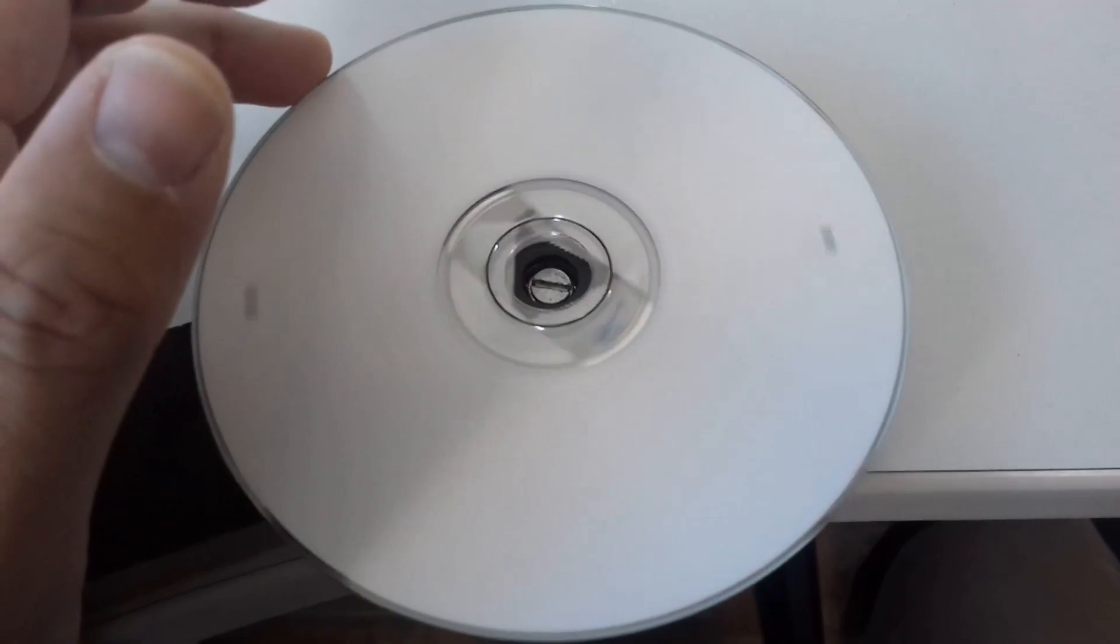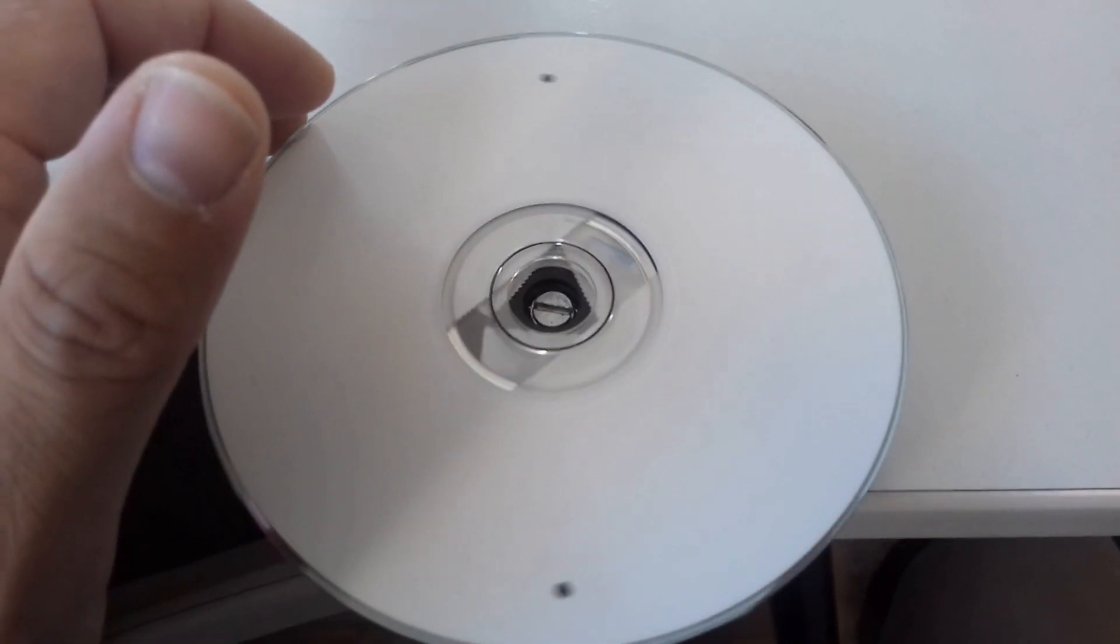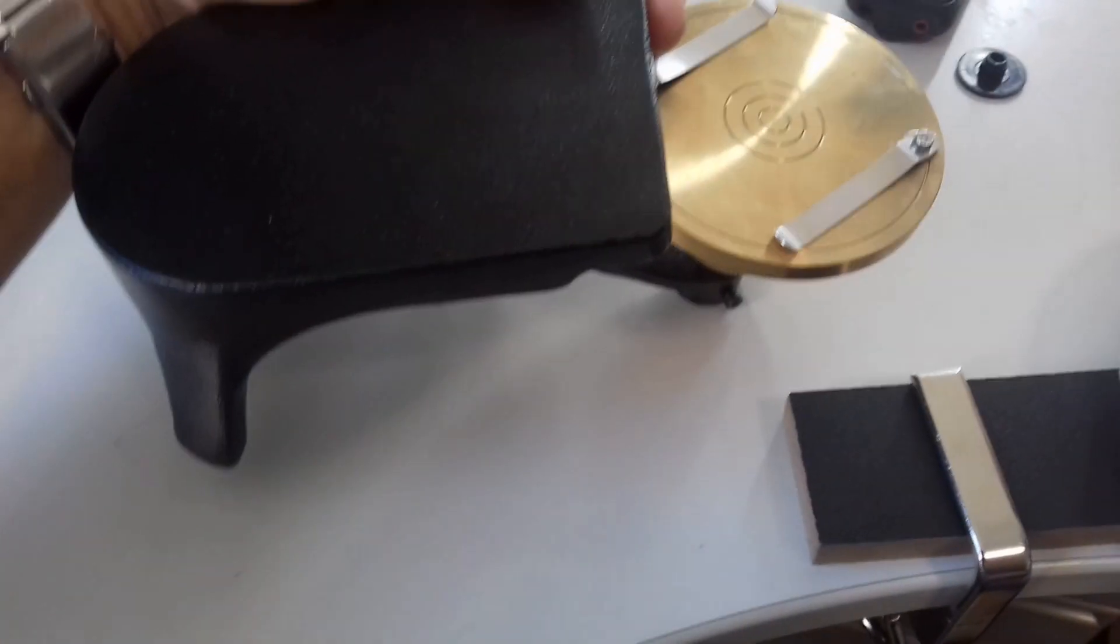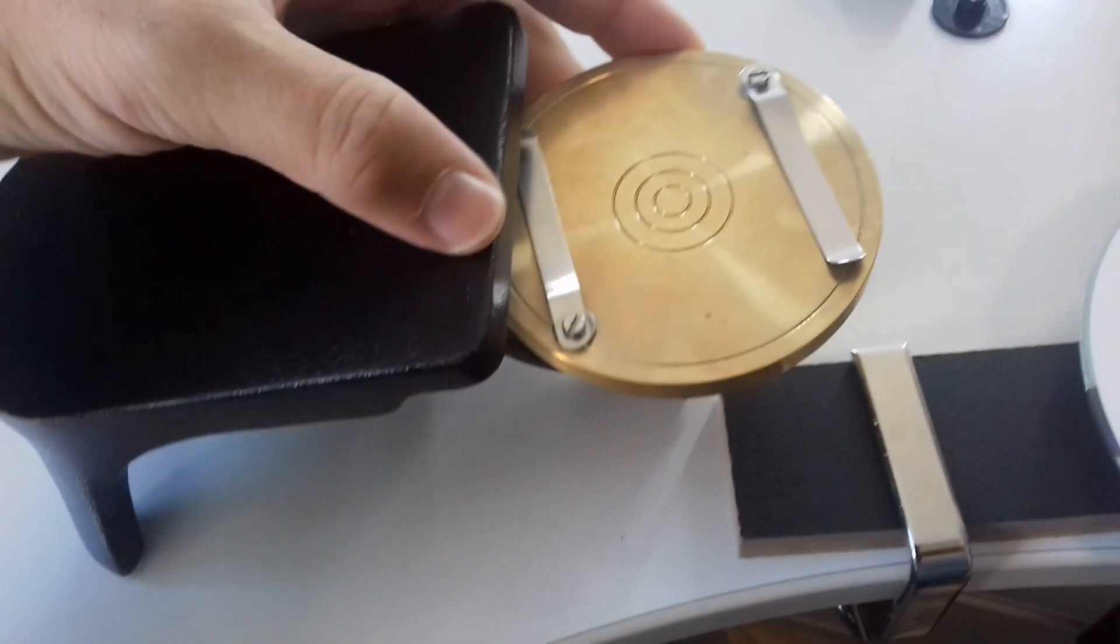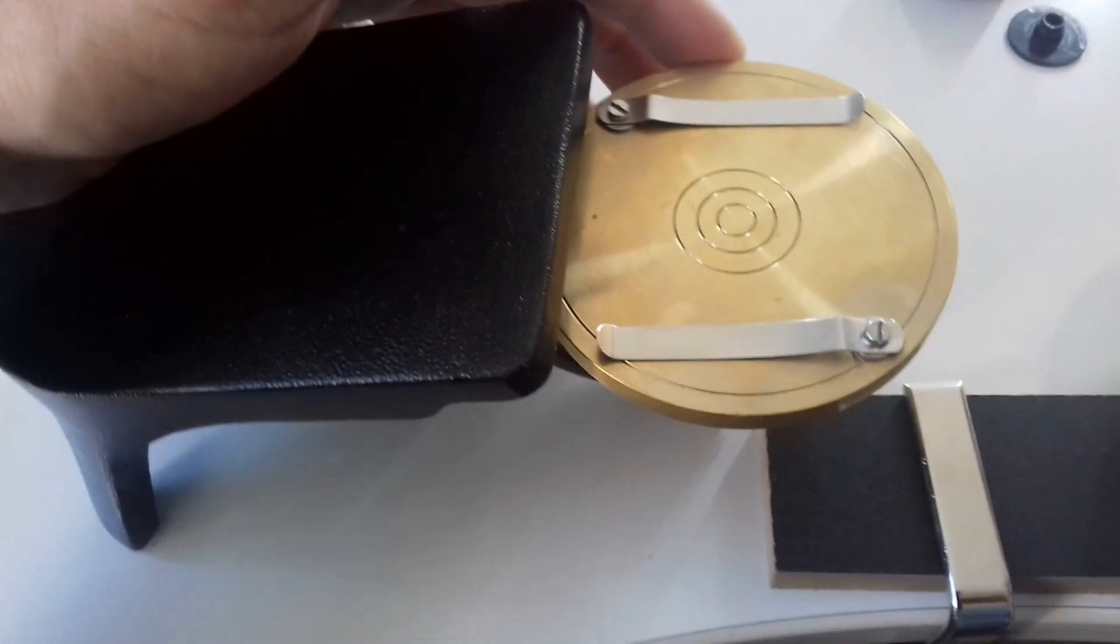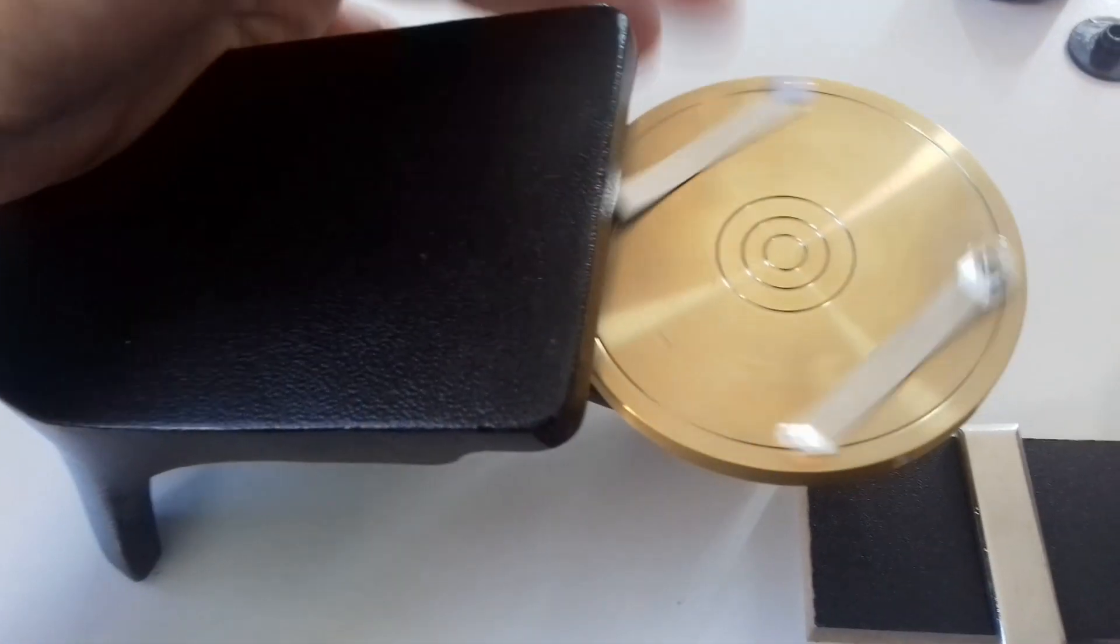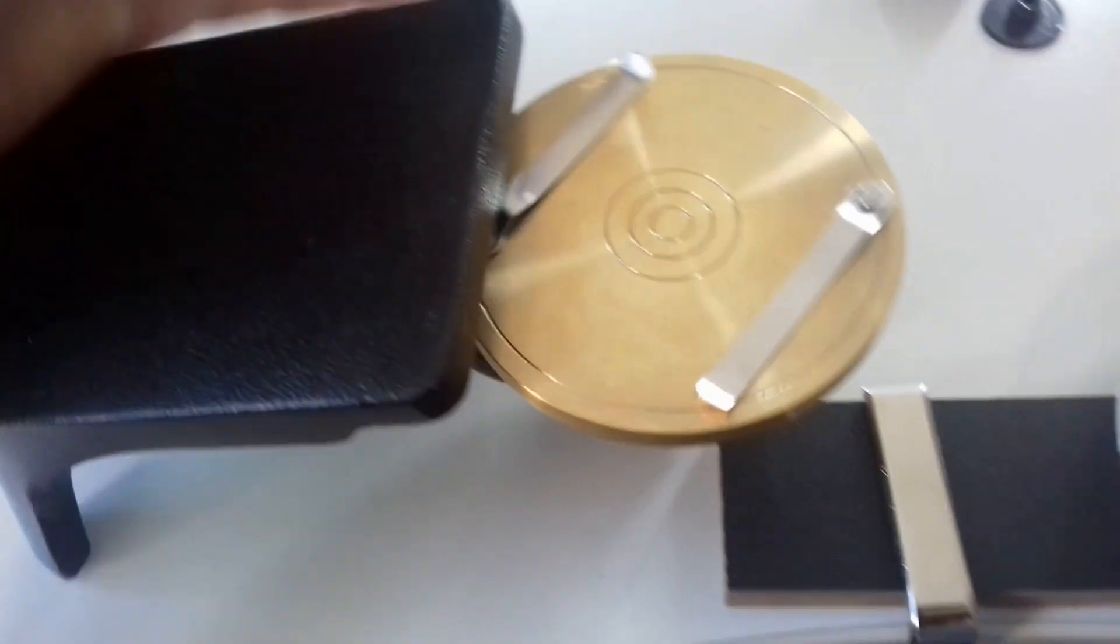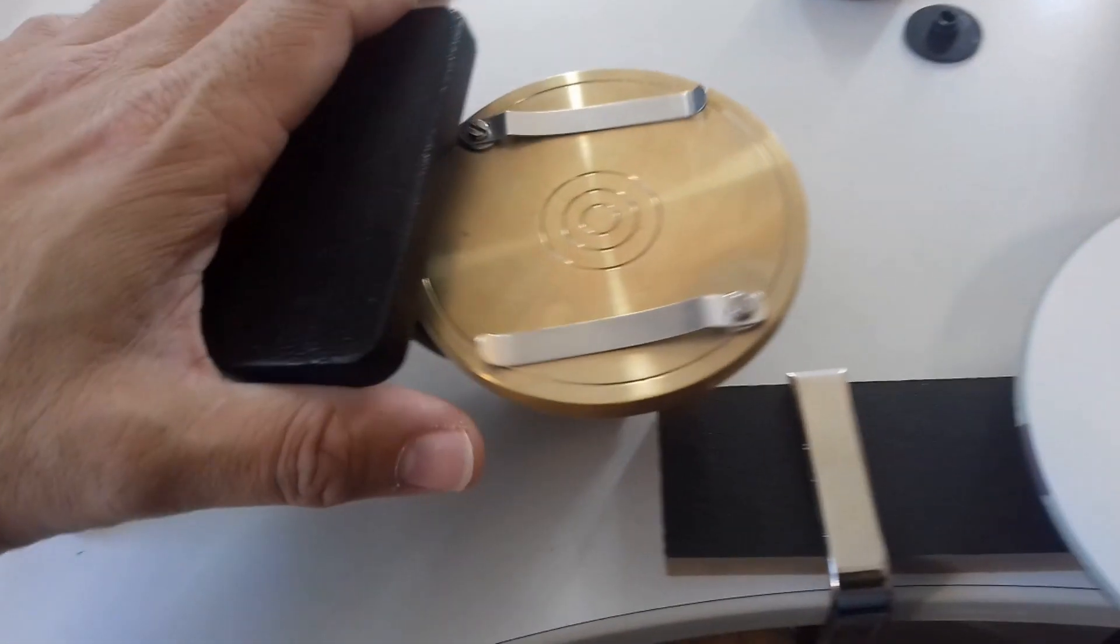Over here I have my sliding table that I ordered. This one is quite heavy and of course it costs more money, and the shipping is more expensive. Both are possible I would say.